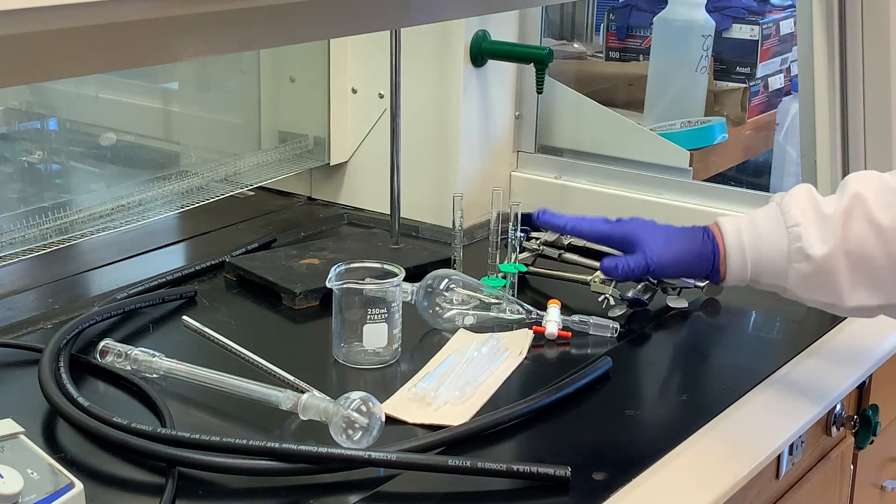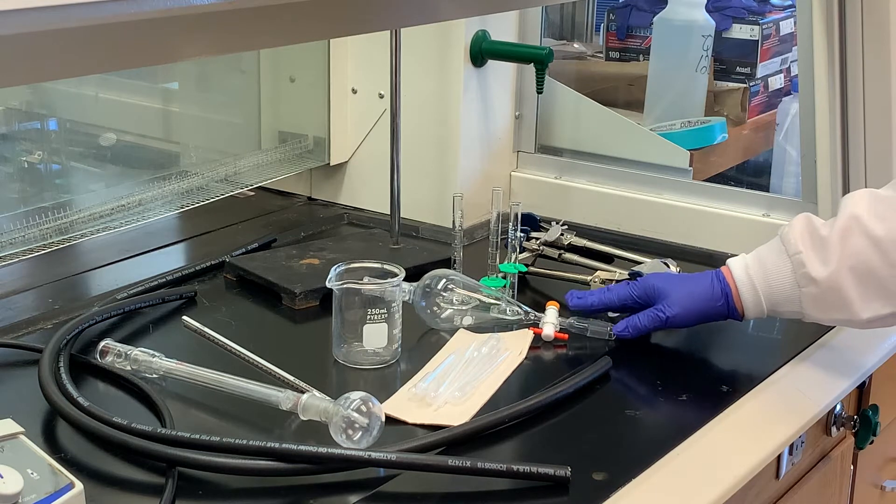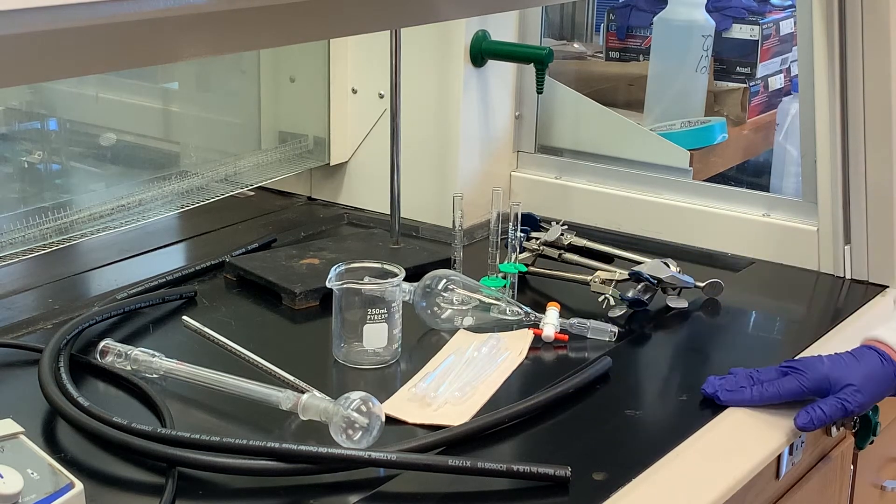After the reaction is complete, we'll need to remove one substance from the other. We'll do an extraction so a separatory funnel is needed.